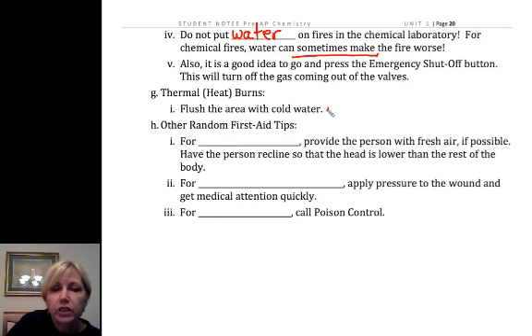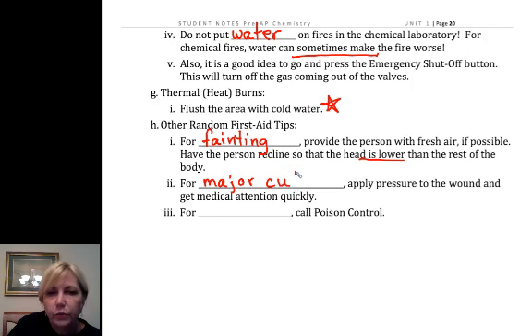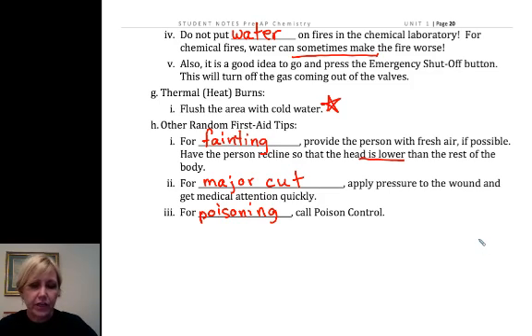If it's a thermal burn, you want to flush with cold water in the sink or the eyewash, then come see me — I have burn cream, or we'll send you to the nurse. For fainting, we want to get the doors open and get the person out in the hallway, because it could be stuffy or there are fumes irritating the person, and make sure the head is lower than the rest of the body. For a major cut, we apply pressure and call the nurse as quickly as possible. The number for poison control is right above my telephone.